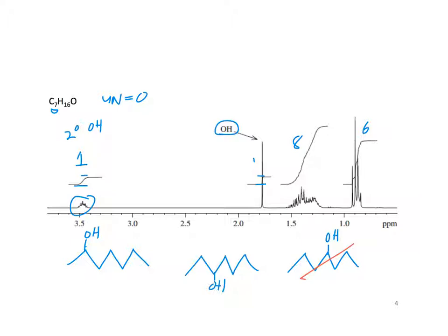I think you're right on that. We've got to look at the methyls here, though. Are they just right on top of each other, or is there some kind of offset? A little offset. So I think the middle one, because there's this little peak right here too.